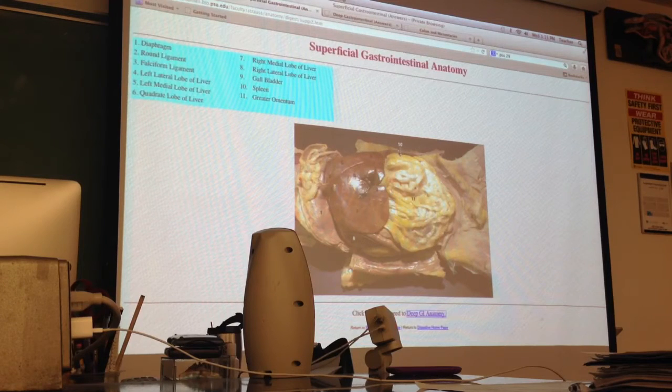The last thing that we can see in this view before we look to see what's underneath all the omentum is tucked right in here with the liver. What would that be? Gallbladder. I hear a few of you saying it, right? Gallbladder. So we have the gallbladder. It's going to be more on the bottom side, but you can see it sticking out anteriorly as well. So you'll be able to see it as, it kind of looks like a deflated balloon. Usually it's green, like you see here, but because they actually stain the hepatic system yellow, you will sometimes see it with a yellow tint also. Alright? So this one's a pretty apparent gallbladder.